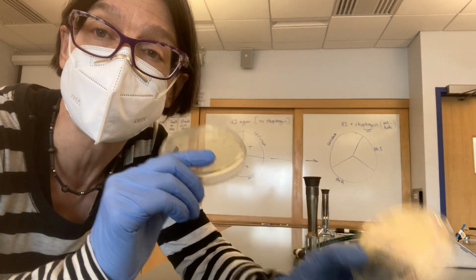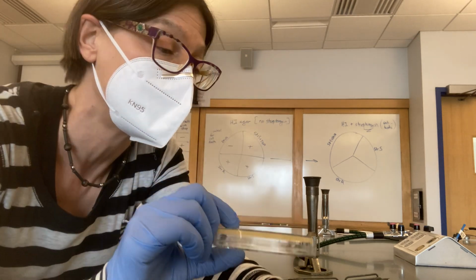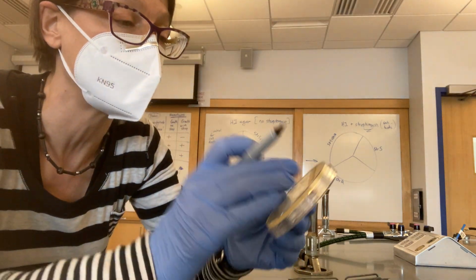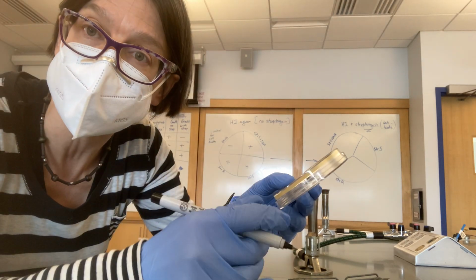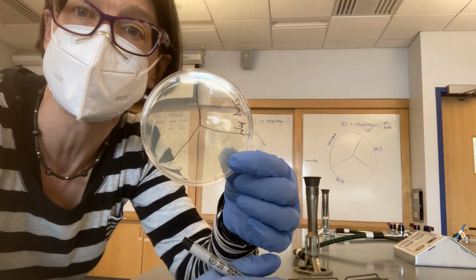They don't look any different, but we know because we put the streptomycin in when we were preparing the media. So what I'm going to do is take this plate of heart infusion agar plus streptomycin, and I'm going to divide it into thirds. I'm done worrying about the DNA solution. That was a control, and it's done. So there are my thirds.